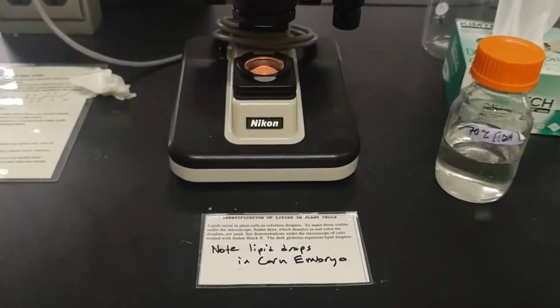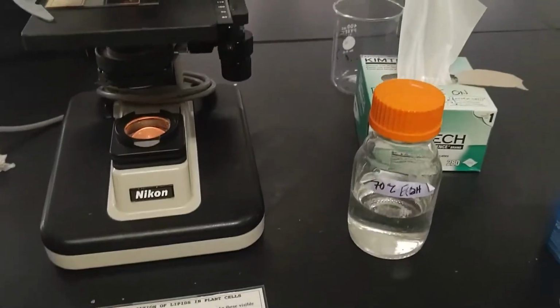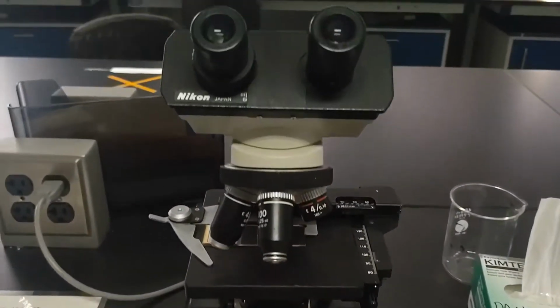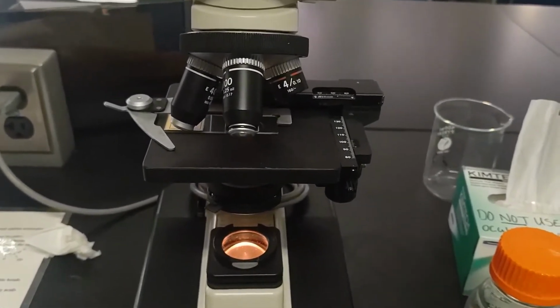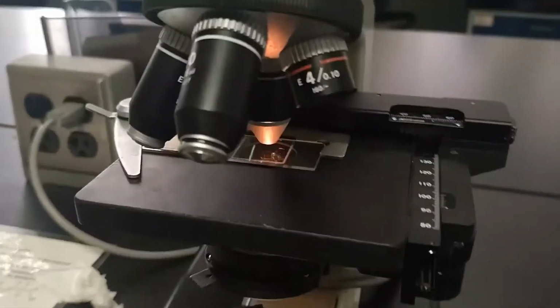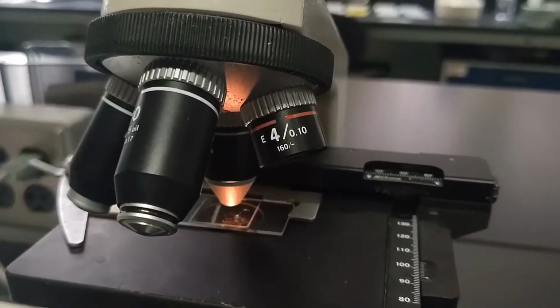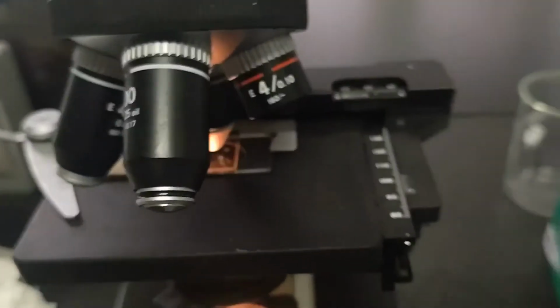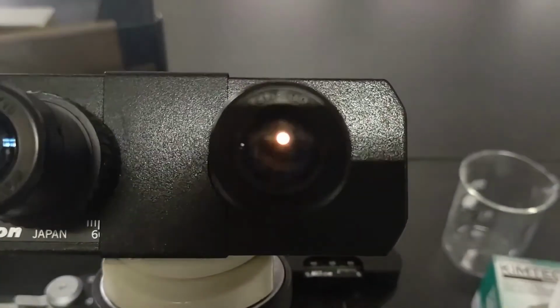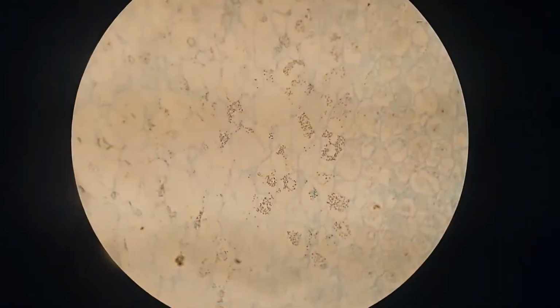Here's our microscope again. Remember, when using a microscope, you should always clean it using ethanol before and after use, cleaning the eyepieces especially, and the main things touched when adjusting slides. Remember always to start out at the lowest objective lens, in this case 4. I have advanced to 10 to see these lipid droplets. So I'm going to zoom in through the eyepiece to try to give you an image of what that looks like, best I can. A bit shaky. There we go. Beautiful.